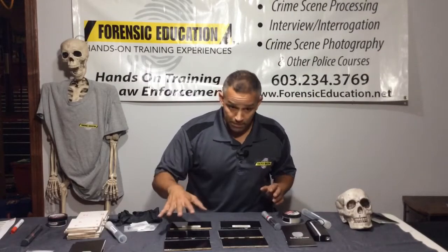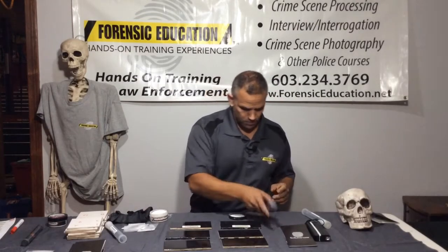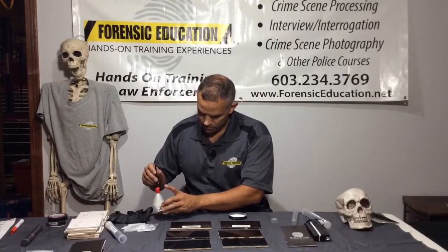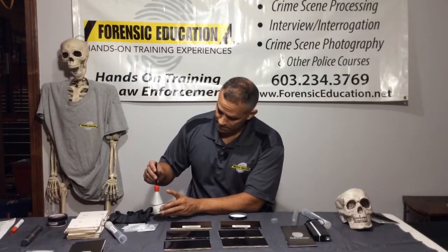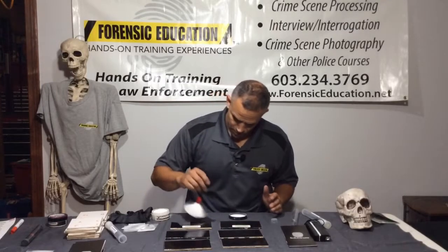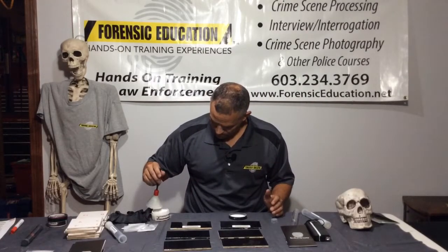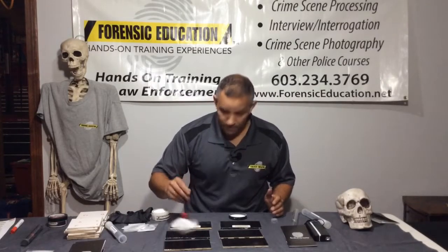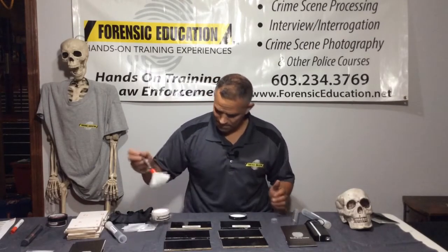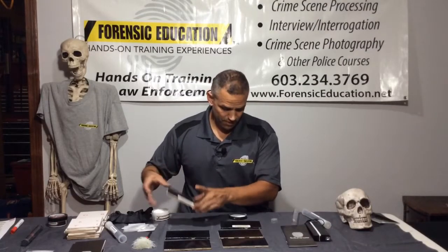Now I'm going to develop using the white powder. I have a nice clean brush. We know we only need a little bit of powder — not too much. I'll go ahead and dust those. These aren't coming out very well. I keep adding more, hoping they're going to pop with the white powder, but this came out like crap. I can see the first ones, but by the end the white powder results aren't very good.